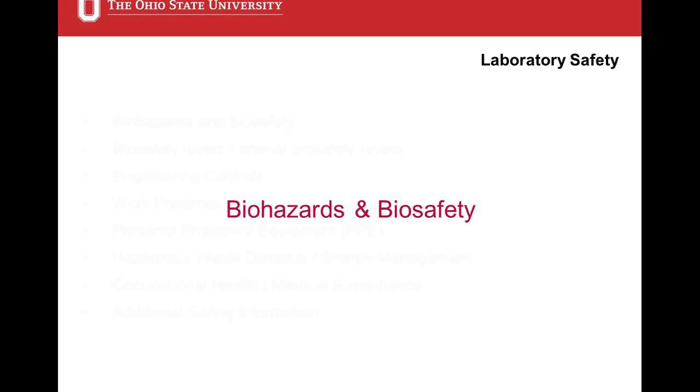You guys are going to be working in, obviously, a biomedical environment, a biomedical laboratory. You will obviously be working with some chemicals, which you will be learning about in your lab standard training. This module that we're talking about today, we're going to focus mostly on biosafety. Okay? And biosafety is all about working with biological agents. The big hazard here, obviously, is biohazards.